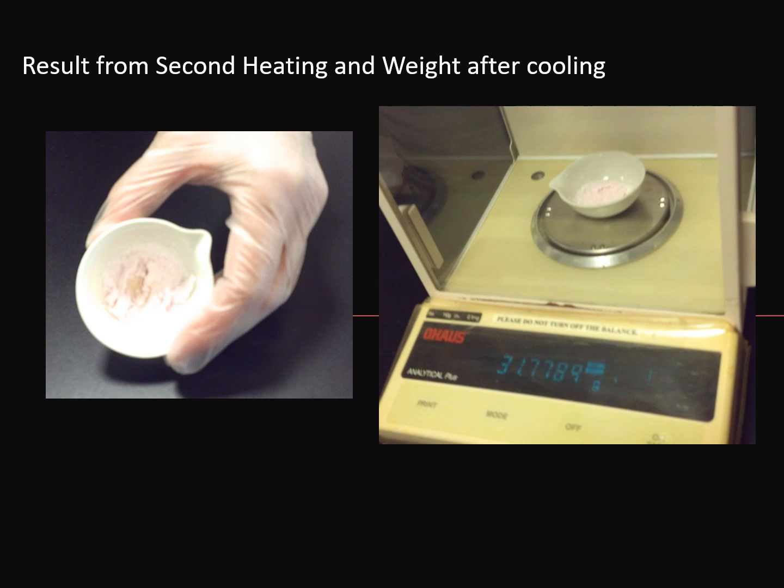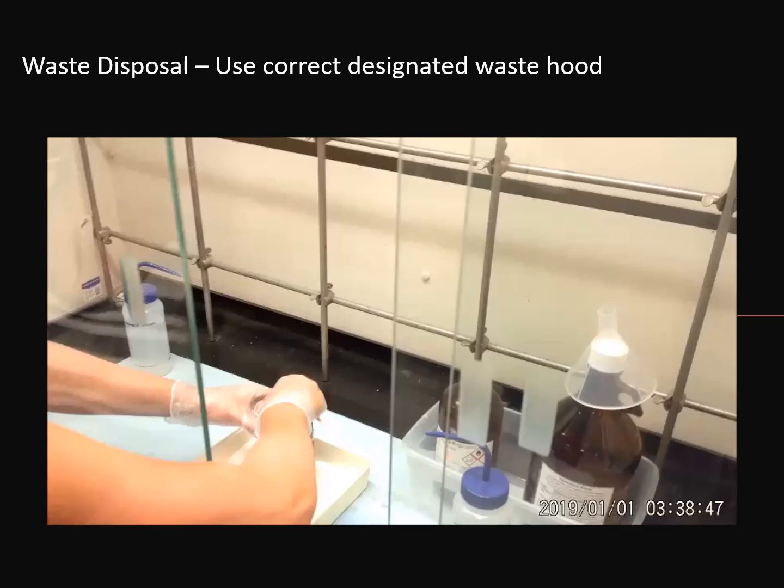If we had a much larger difference, then we'd have to do a third heating. But in this case, it was small. So once we do that, we're done with all our experiment, and now we have to do our waste disposal. So remember, you're going to look at the hood that has a label R120 on it. When we dispose of it, let me just show you what you do.